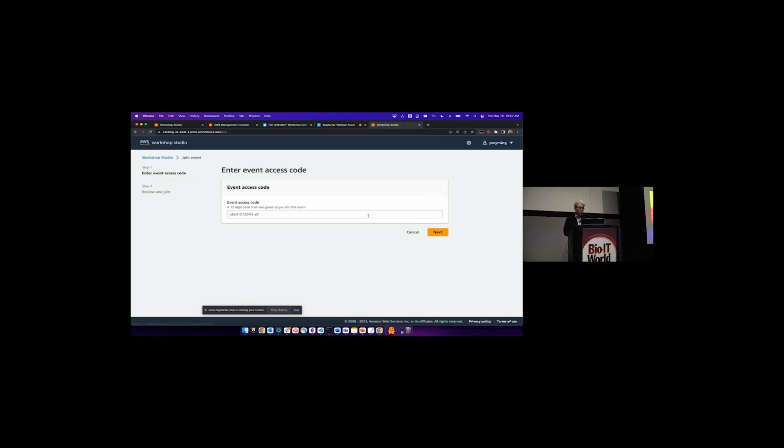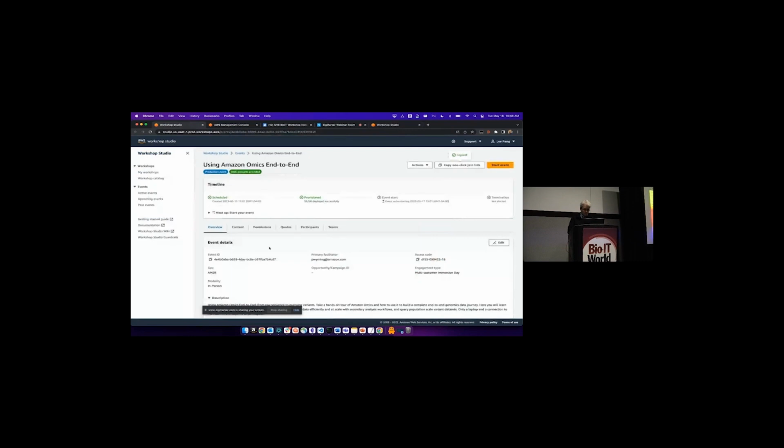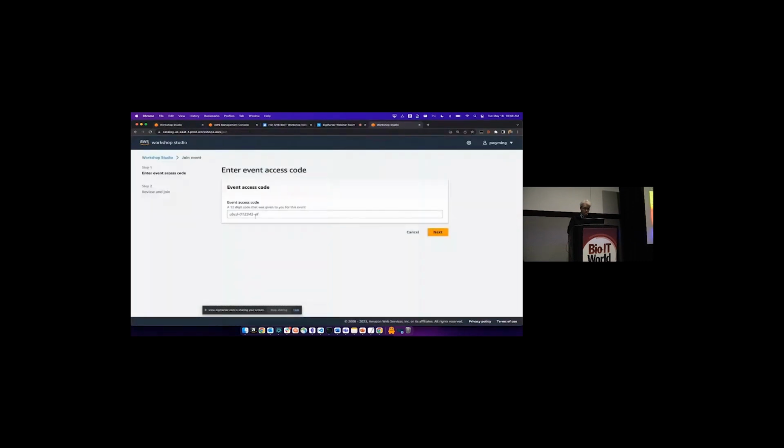And so once you get there, you'll get to here. This should already be filled in, or not. This is my access code. For you, this should already be filled in. I don't know why it's not for me. Go on next.